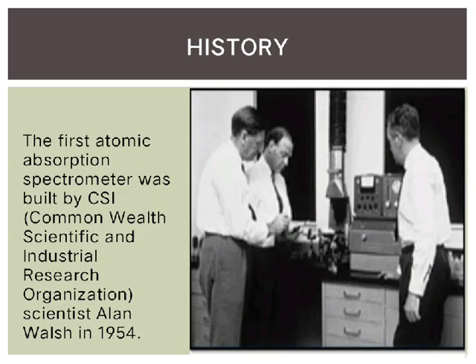The history of atomic absorption spectroscopy: the first atomic absorption spectrometer was built by CSIRO, that is Commonwealth Scientific and Industrial Research Organization. Atomic absorption spectroscopy was first discovered by scientist Alan Walsh in 1954.